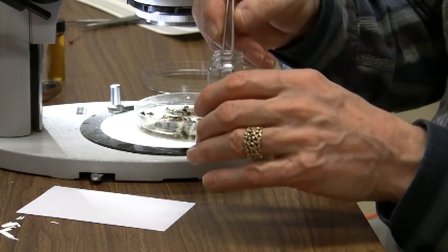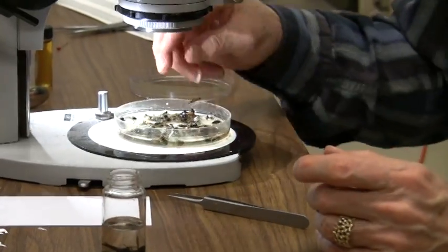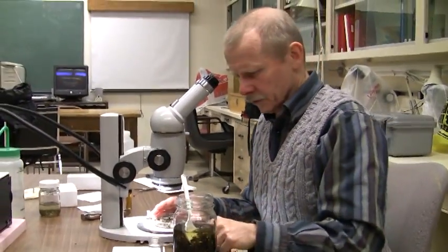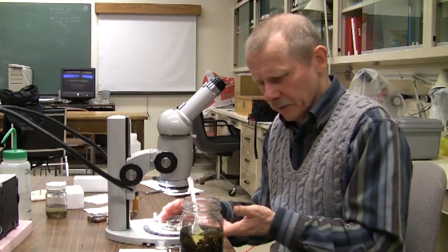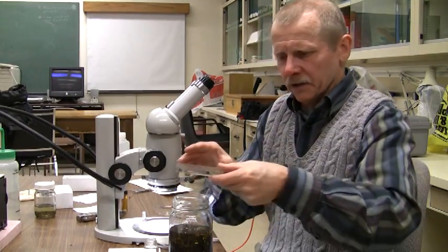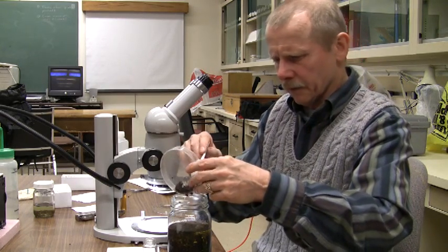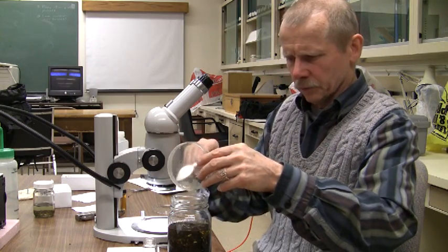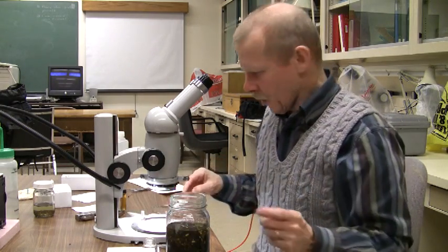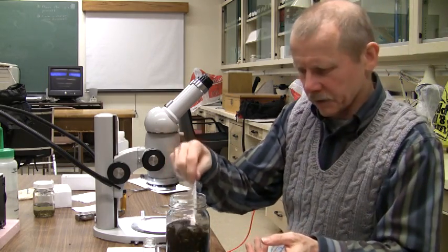That looks like one more specimen here. That's really all we need to do to actually sort the specimens. Normally what we would do is keep these separate — that is, have a jar of the sorted and a jar of the unsorted. But given that your partner and some other students in the course may look through this material as well, what we're going to do is just put it back into the general jar with the rest of it. When you're done, just carefully push it back into the general material and seal it up. If you want another look, stir it up again and give it another go.